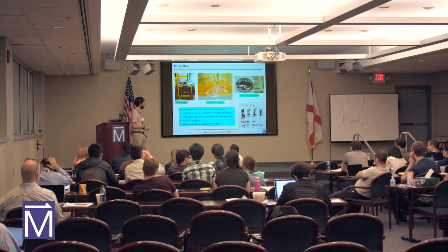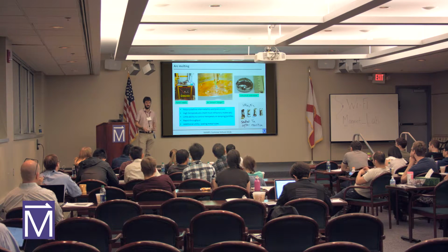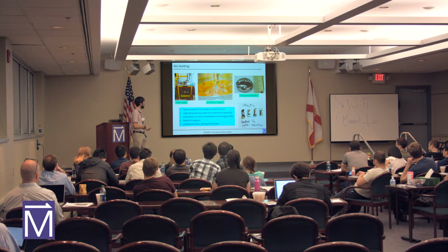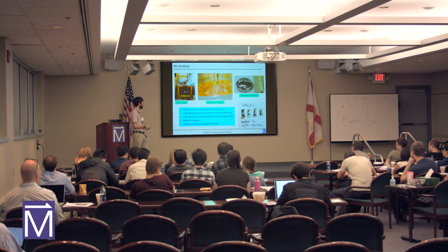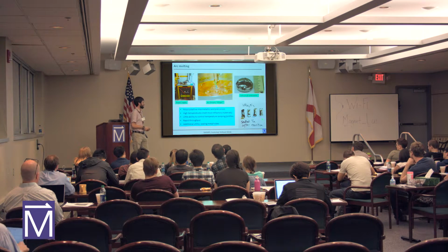The other thing that I want to tell you is that sometimes you may want to perform your reaction in a refractory metal crucible, like tantalum. And one of the best ways to seal your material inside of such a crucible is using an arc furnace like this. So these are reactions where we've made uranium ruthenium-2 silicon-2. We've stuffed the material in there, we've pinched the ends, and we've just arc melted the end. And when you do that, you can go to high temperatures as long as you keep this under an argon atmosphere, so it doesn't oxidize. You can put things in here that have really high vapor pressure without blowing them up. In a quartz tube, you have to be careful to avoid blowing things up.